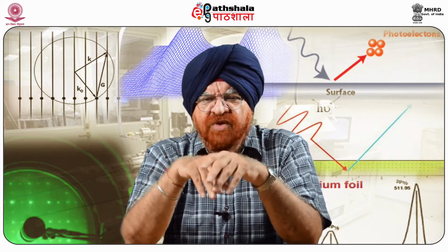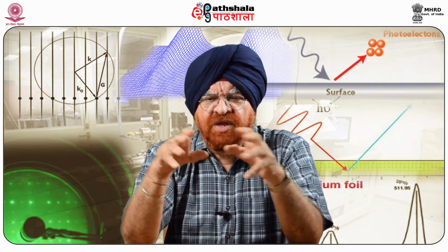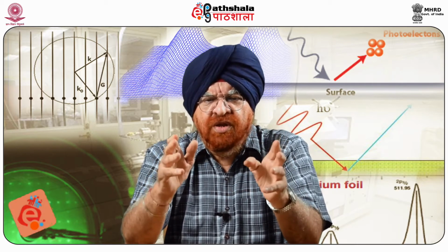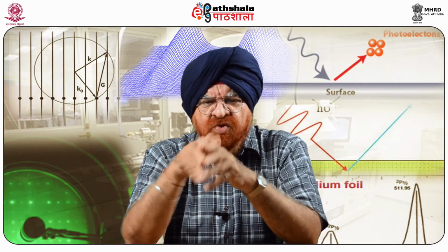We covered the basic principle of CFM, some examples of its applications, and theoretical models that provide the basis for understanding the experimental results. We can emphasize the application of modern kinetic theory of non-covalent interactions to the analysis of CFM data, which is pretty important in order to understand these interactions.